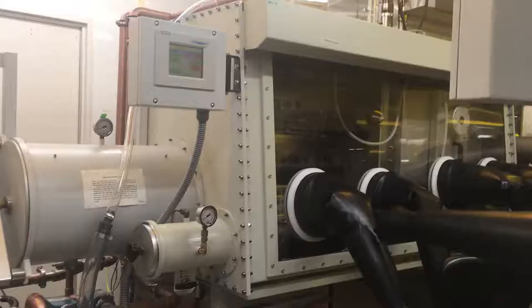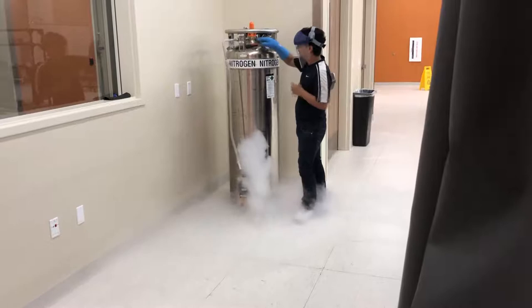Hi! Welcome to the Opto-Electronic Organic Chemistry Lab. This is where we spent half of camp making our perovskite samples to then test at the photonic center, where we spent the other half of camp. Along the way, we learned about important lab safety and became exposed to different lab materials and techniques.